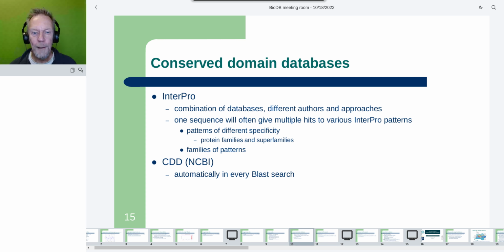And so if your unknown sequence picks a hit for alpha carbonic anhydrase of the eukaryotic type, and your sequence comes from a eukaryote, then you can be fairly confident that, okay, this protein is an alpha carbonic anhydrase. If your organism is a vertebrate, there are profiles which are narrower, so that it will tell you if it's a part of the subfamily of CAs 6, 9, 12, and 14, or whether it's a CA5-like sequence, etc.